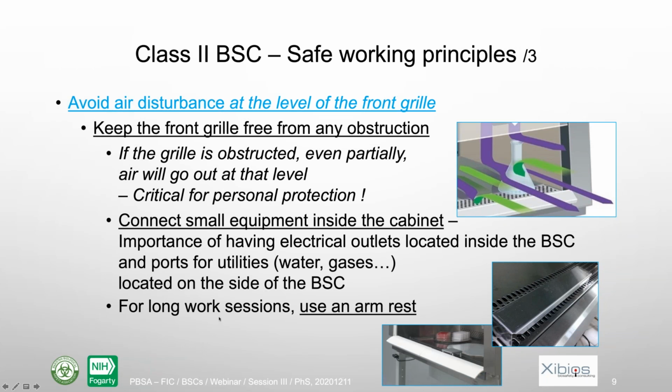Also, for long work sessions, you should use an armrest. Here you have two models. This one is built in. It's linked to the biosafety cabinet. This one is something that you can move, and you can use it when you need it, where you need it. And if you don't have anything which is built in like this, you could always have this kind of product purchased or even made, so that you can rest your arms without blocking the access of the air to the front grille.